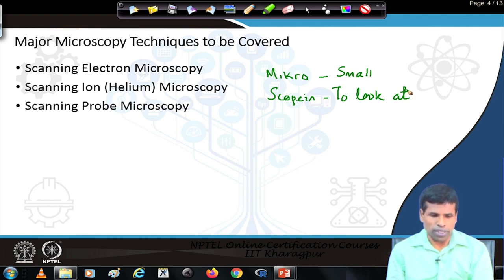And then we have probe microscopy. We were talking about how we are in a dark room and there is no presence of light. And we discussed that we cannot see an object if there is no light. But actually, you can still know the presence of an object in the room in the absence of light. How would you know the presence of an object in the absence of light?